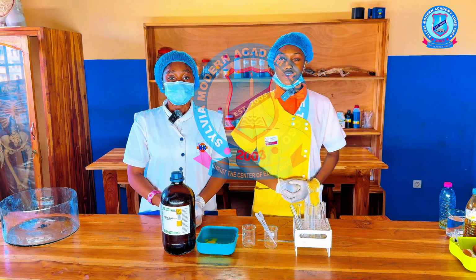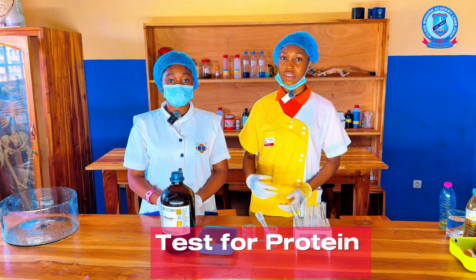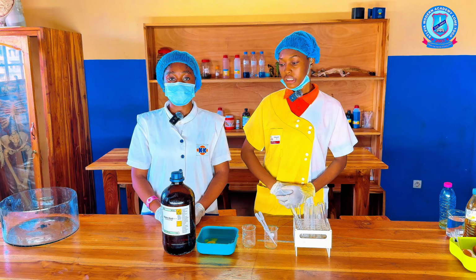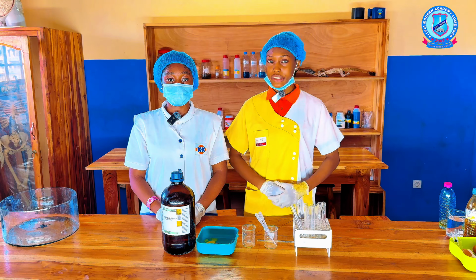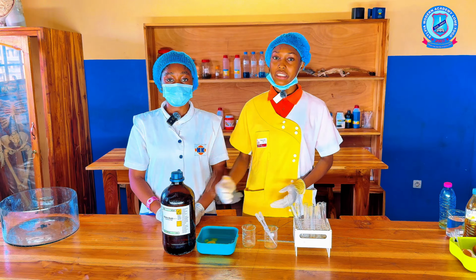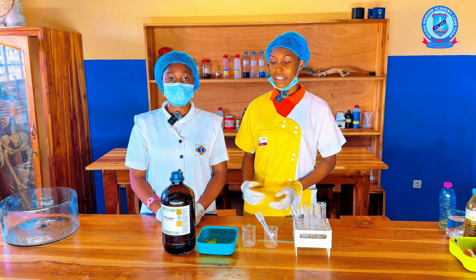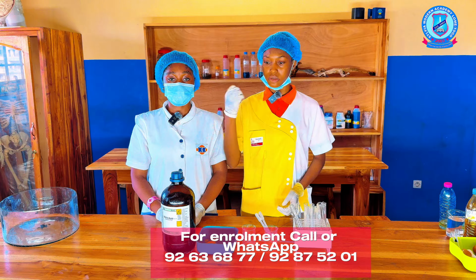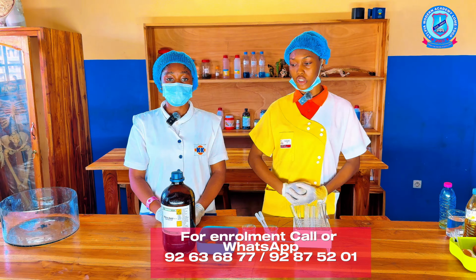I'm here to test for the presence of protein using our egg white as a food sample. To test for the presence of protein, we are going to use our xanthoproteic reagent, which is also called nitric acid. Normally, nitric acid is colorless, but when added to the food sample, which is the egg white, it forms yellow and tends to harden and form a solid.